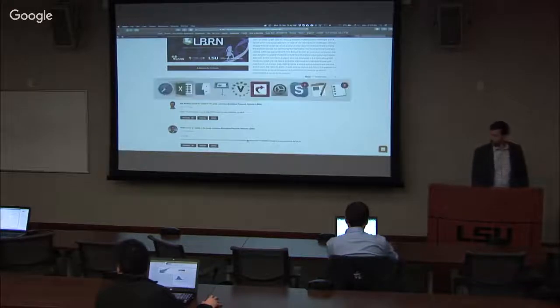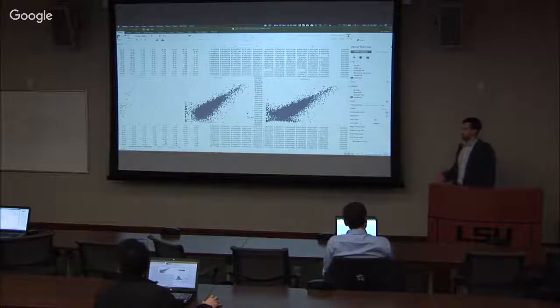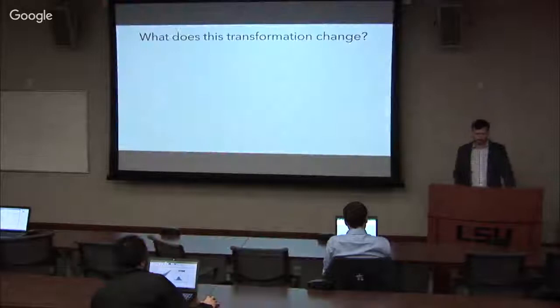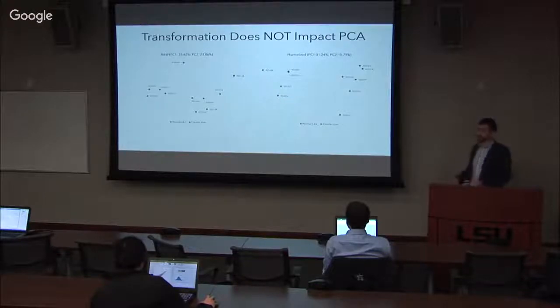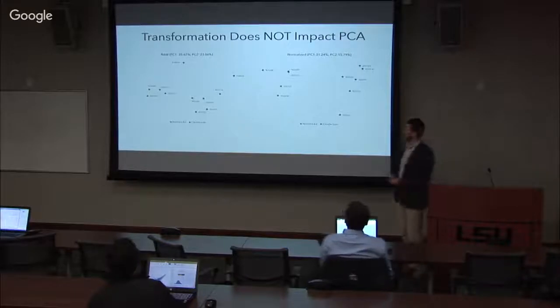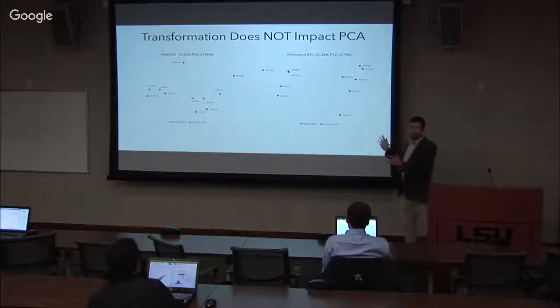Okay, so what we were doing is just quantile normalization and looking at the impact. Right now, we know that our data is normalized and ready for analysis, but what we can often see is that this transformation can sometimes not impact PCA at all. It can change it visually, as you can see the difference here, raw versus normalized. But there's not a lot of significance to our ability to interpret. Sometimes the numbers just switch their positions, but it's basically the same thing. Maybe it's wider between them.